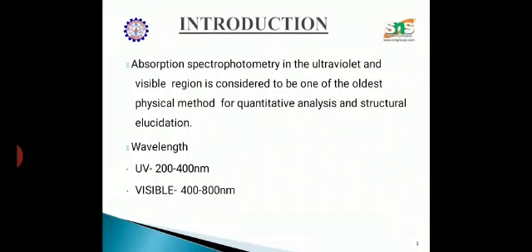in the range of 200 to 400 nanometers, and a solution, depending upon its concentration, absorbs the ultraviolet radiation. So remember that at one end the light is passed, and in the cuvettes you will have the solution, and the light will travel through the solution and come out of that.